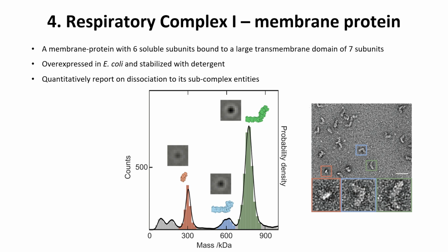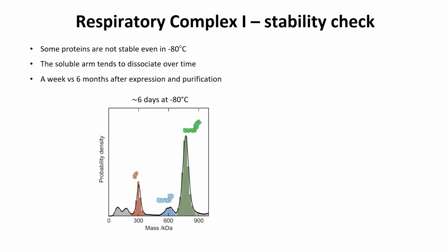Another thing which is really nice, which is also related to stability check, is that some proteins are not stable even at minus 80.